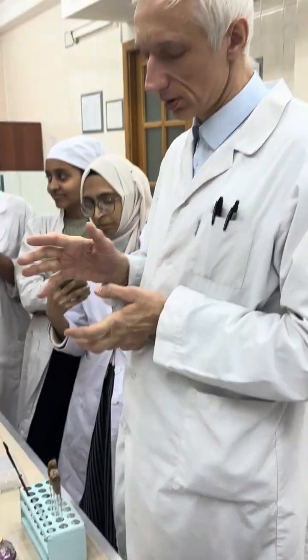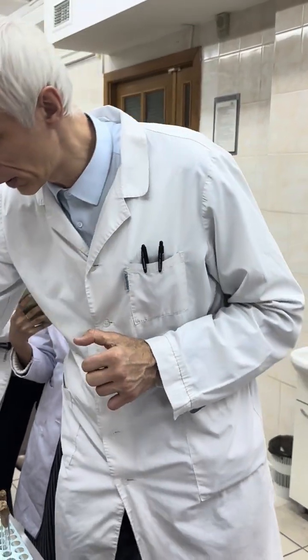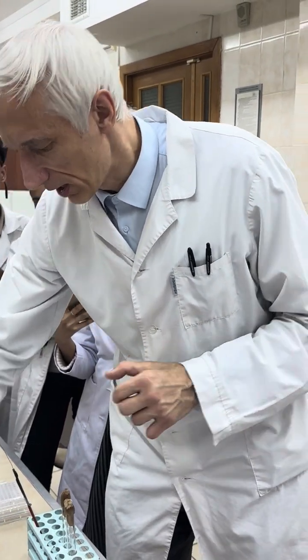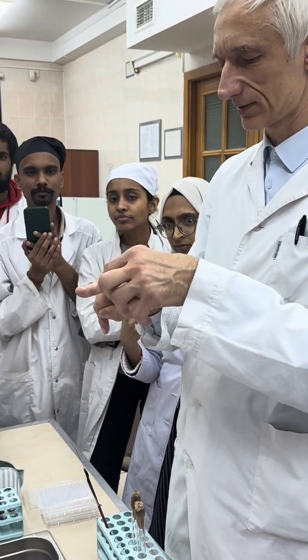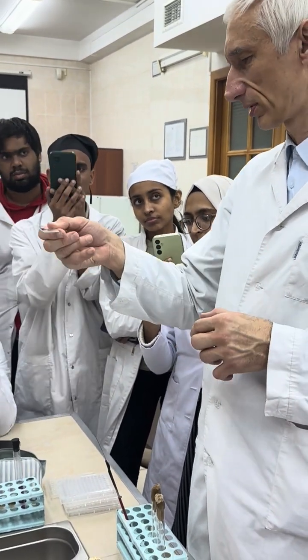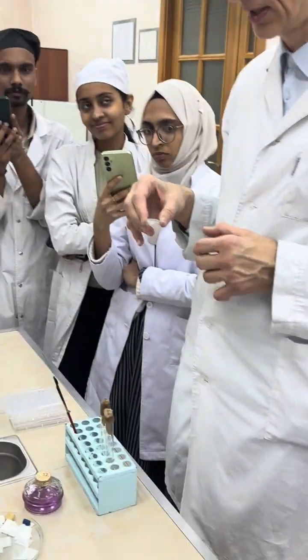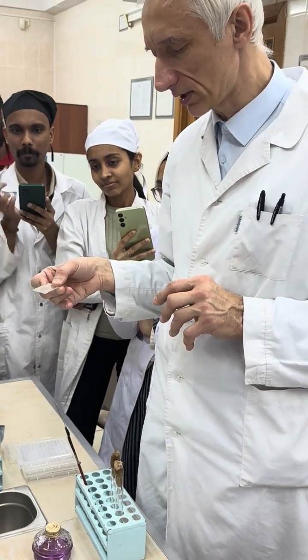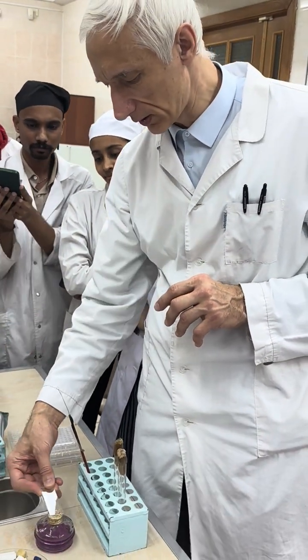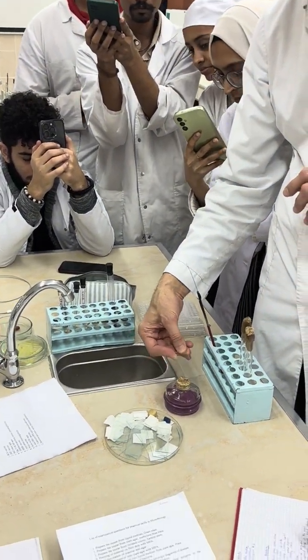After that, drying through the fingers and fixing. Students sometimes try it like this all the time. Not a problem. Hold it this way, and this will be correct. Control the flame. So after drying, fixing three times, but slowly enough: one, two, and three, not from the top but the middle part of the flame. One, two, and three, something like this.